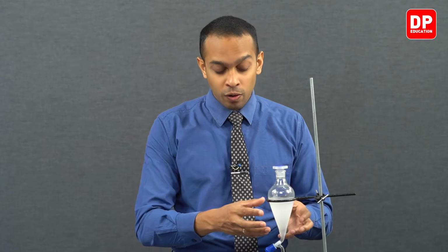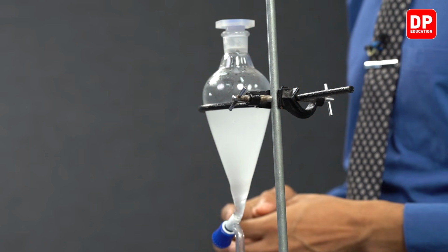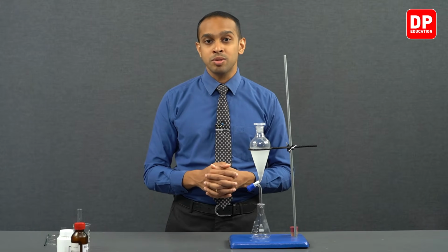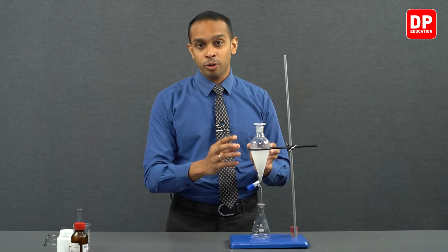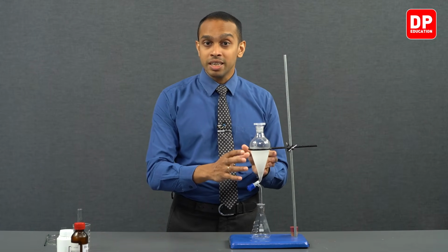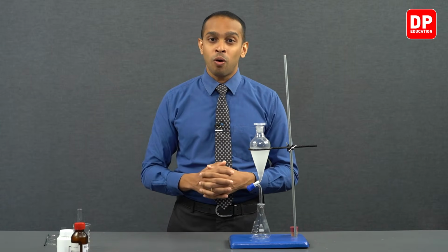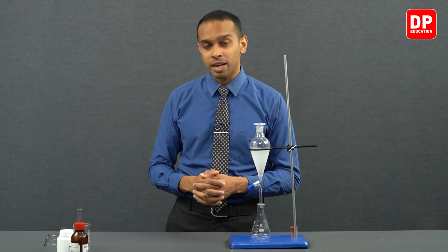The majority of the oil present in this aqueous mixture will dissolve in the diethyl ether layer, and we will continue to do this multiple times until almost all of the essential oil is extracted into our organic solvent layer. So let's move ahead and do that.